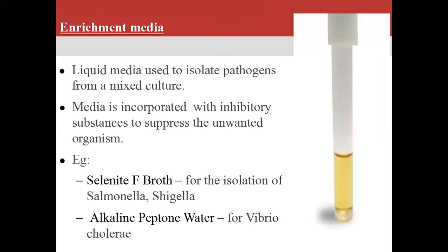Next, enrichment media. Enrichment media is the liquid medium. Enriched media is the solid media. In enrichment media, we add some inhibitory substances to the liquid culture media. These inhibitory substances suppress the growth of unwanted bacteria, and they promote the growth of the wanted bacteria. So enrichment media is the liquid media, and this liquid media helps to isolate pathogens from a mixed culture.